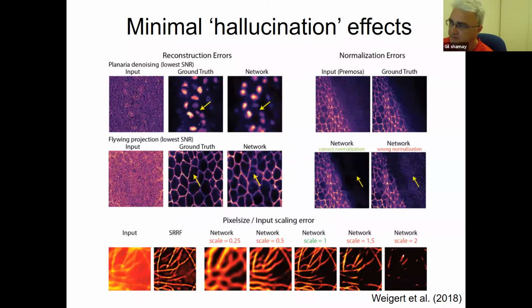So let me see if I got you right. The network gets an image of a given size, right? So you can give only the same region to the network, right? Training data is based on patches that you take from a lot of images. So this will not help. But is this what you meant, or something else?